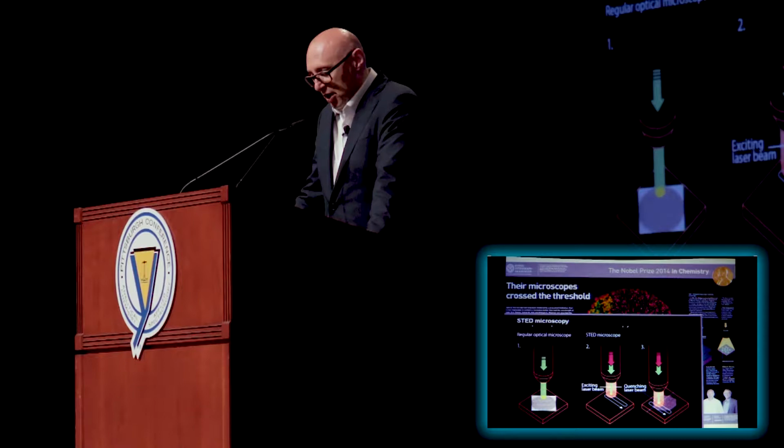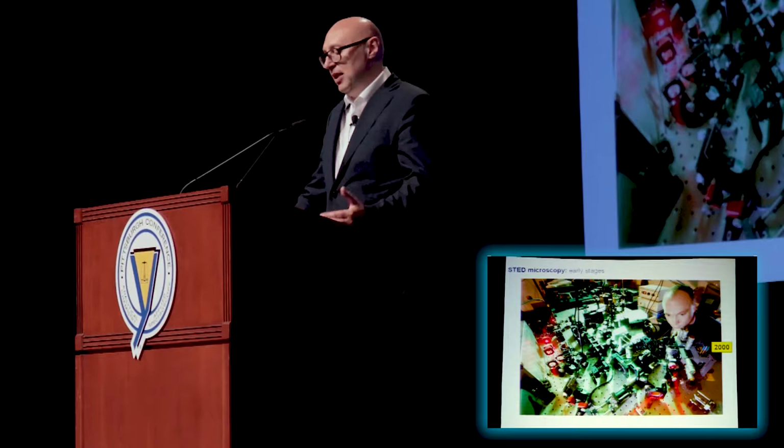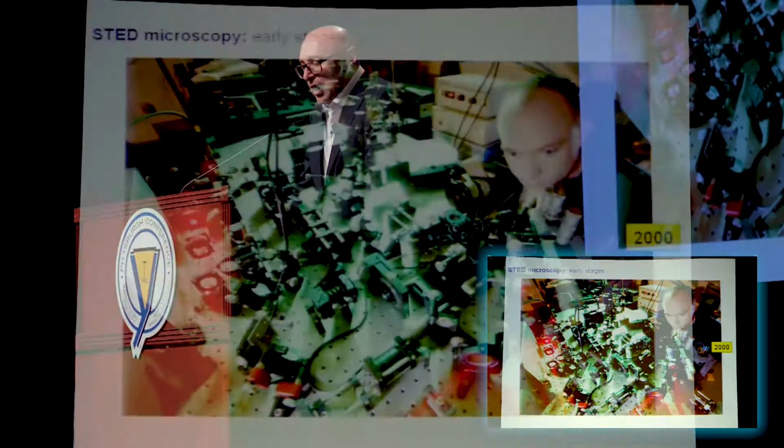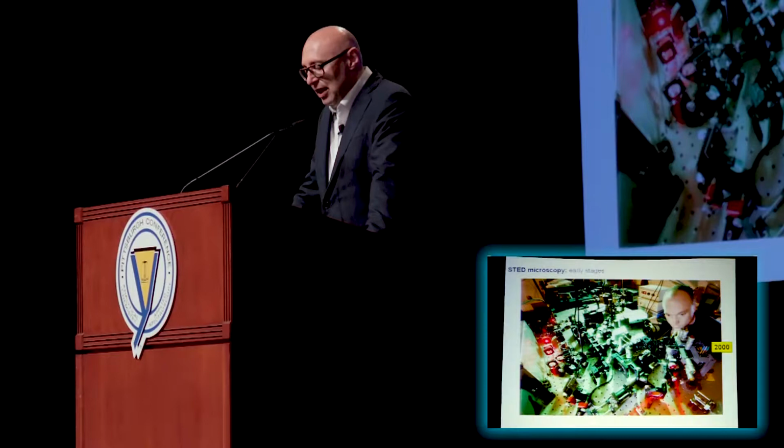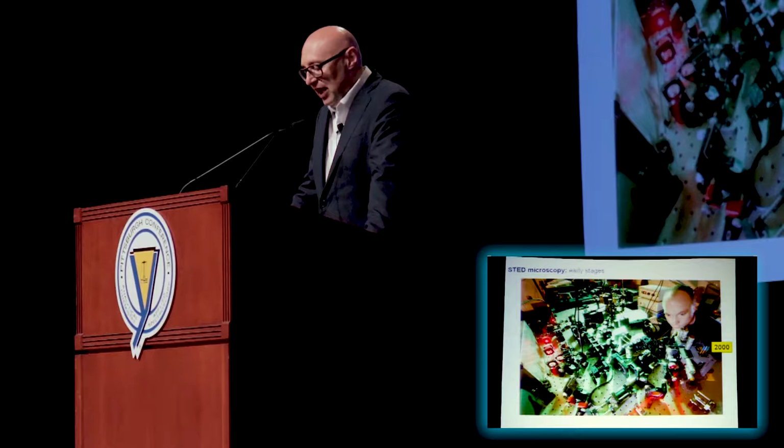Now, at the time the principles of this microscope were demonstrated, that was 1999-2000, STED microscopy looked like this. This is a picture of an early-stage laboratory STED microscope showing one of my PhD students at that time. And of course, if you don't know how well it works, you still have to do research on the principles. You don't know what you have to leave out in order to make it viable. By now, we have understood it very well.